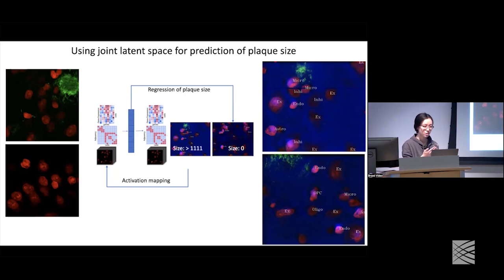So there are cell type differences, but it's also interesting to notice that the blue regions are not only highlighting individual cells, they're also highlighting specific regions in the cell chromatin. If we look closely here, for example, in this excitatory neuron, the blue is only highlighting this region with very dense chromatin inside the excitatory neuron.